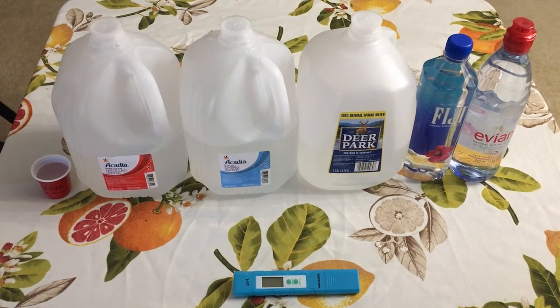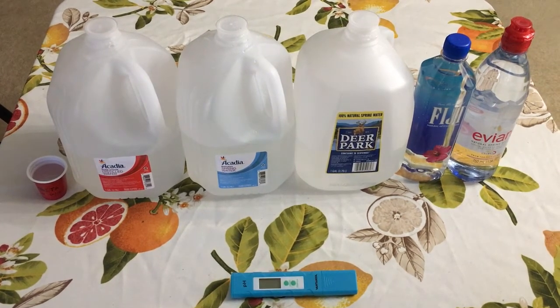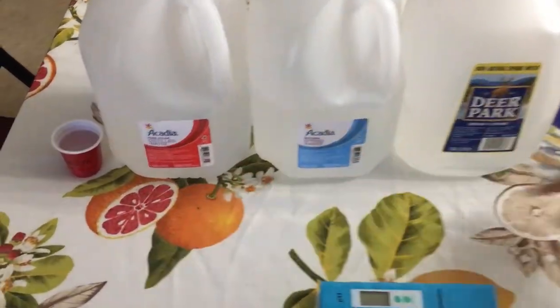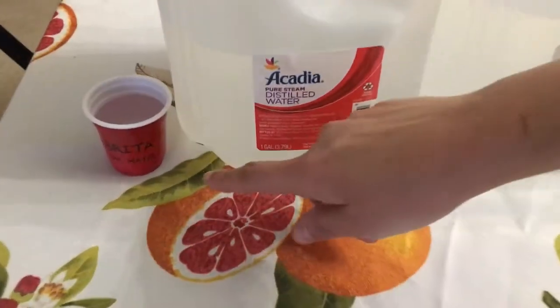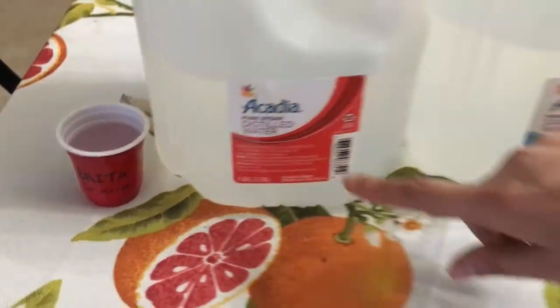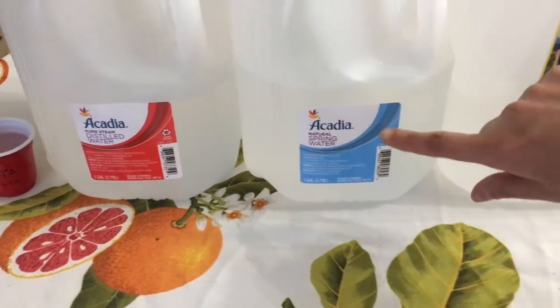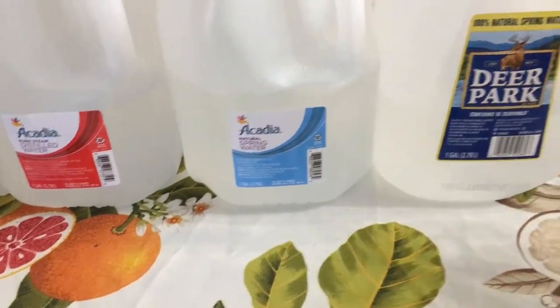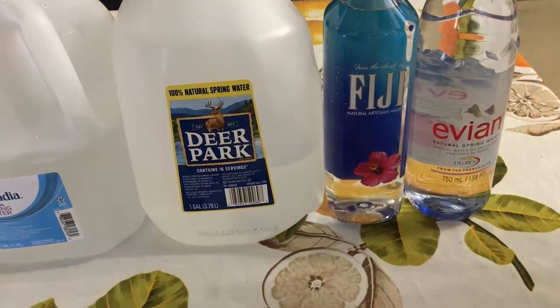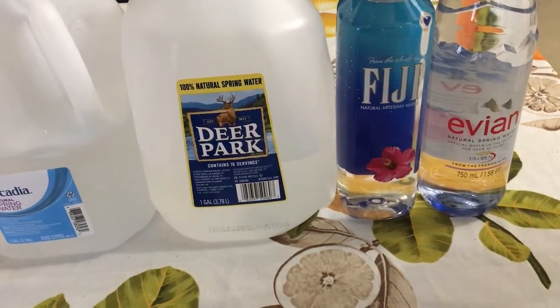Hi everyone. In this video I'm going to perform a pH test on water. Here we have different types of water: the first one is tap water filtered using Brita, the second one is Acadia distilled water, the third one is Acadia spring water, the fourth one is Deer Park, the fifth one is Fiji, and the sixth one is Evian.